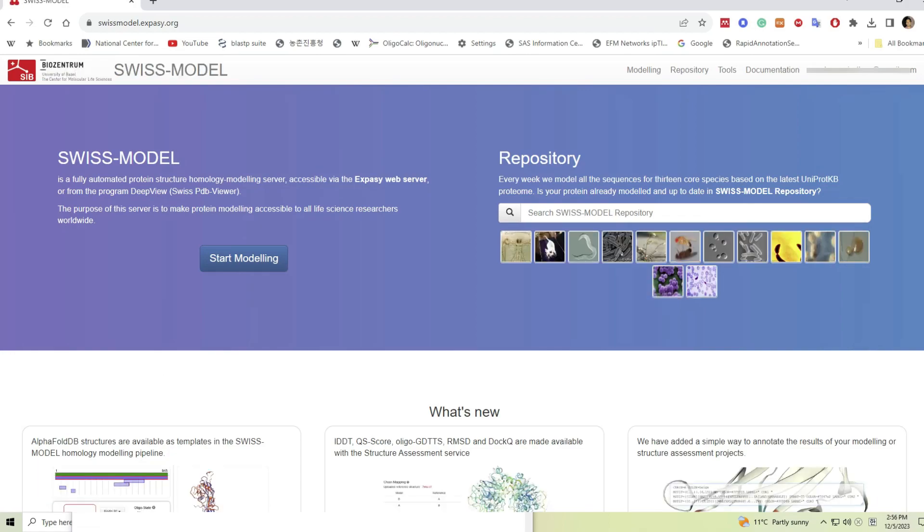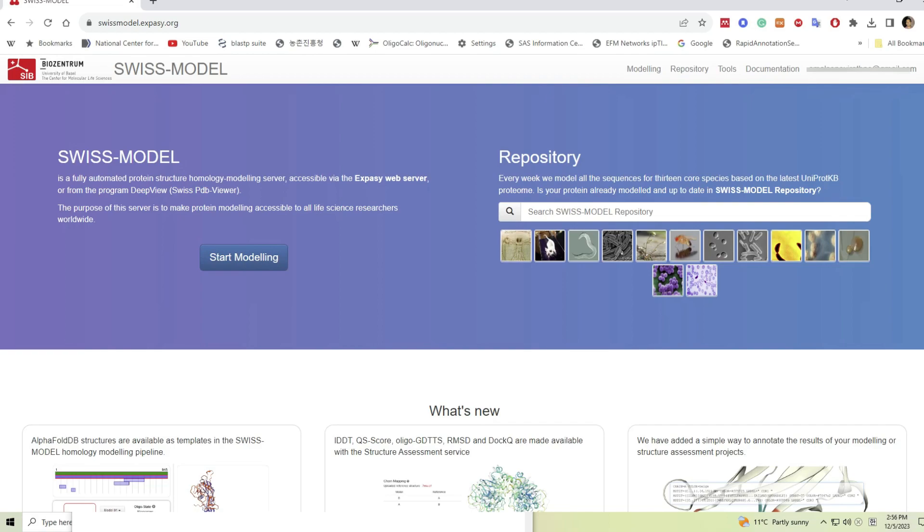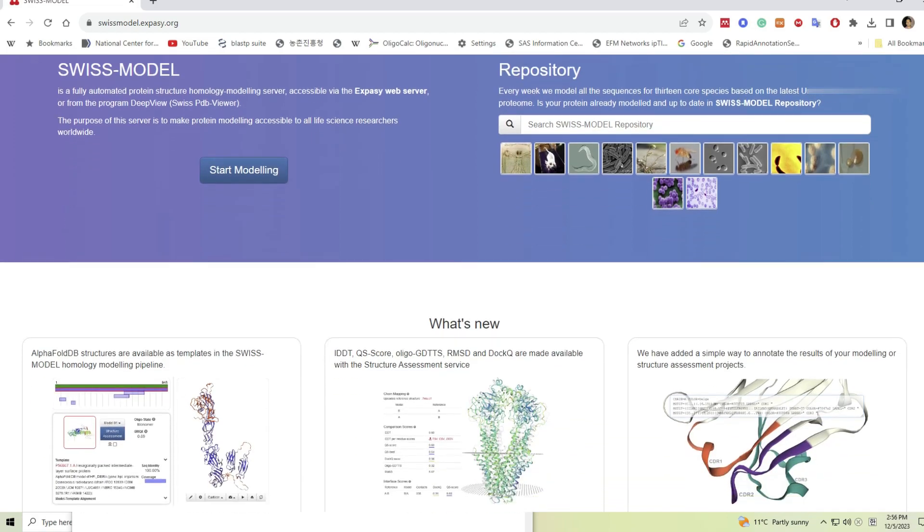Now in the opening web page, you can see the button for starting model.